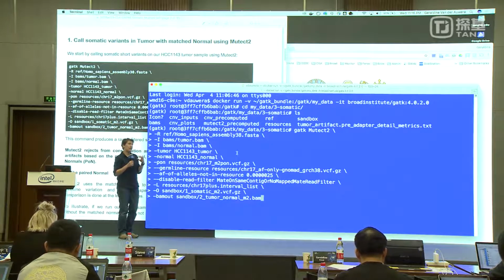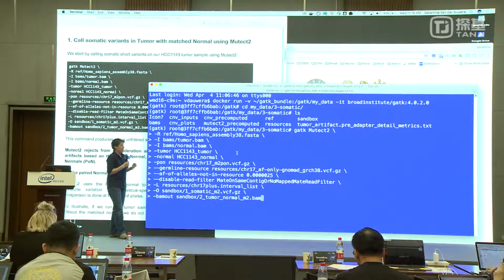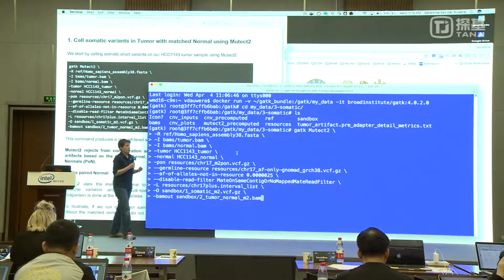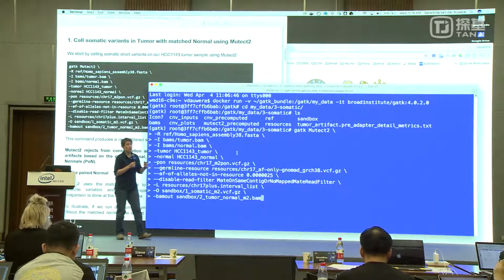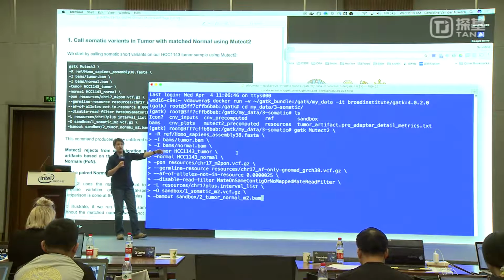It's kind of an upper value. You're basically saying, at most, if I'm not seeing this allele out of a population of 200,000 samples, then it must, if it's a real germline variant, be present in at most 1 in 400,000 human chromosomes out in the wild.